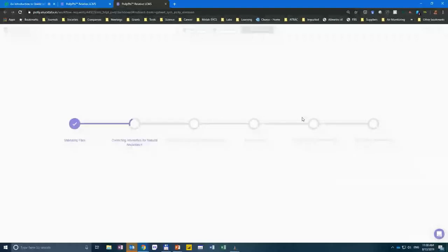After the files are validated, the natural abundance is corrected automatically. And after this is removed, the fractional enrichment is also calculated and the data is merged. Those can actually be done manually within the Poly interface, but this is a very convenient way of doing this, since basically everything has been combined into one. So this is pretty much it. The final step is just generating visualizations. And as you can see, this entire process takes a few minutes.